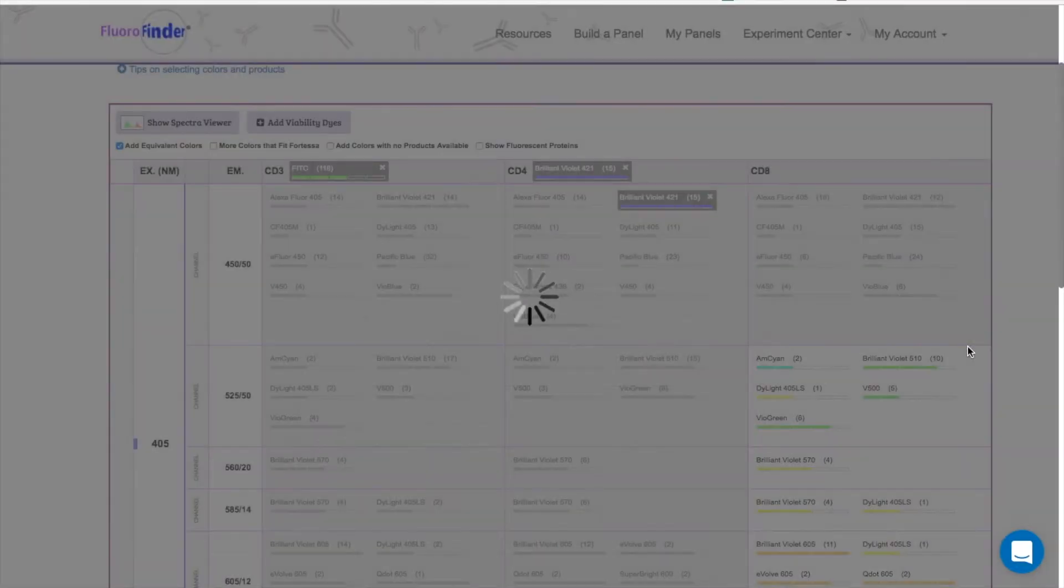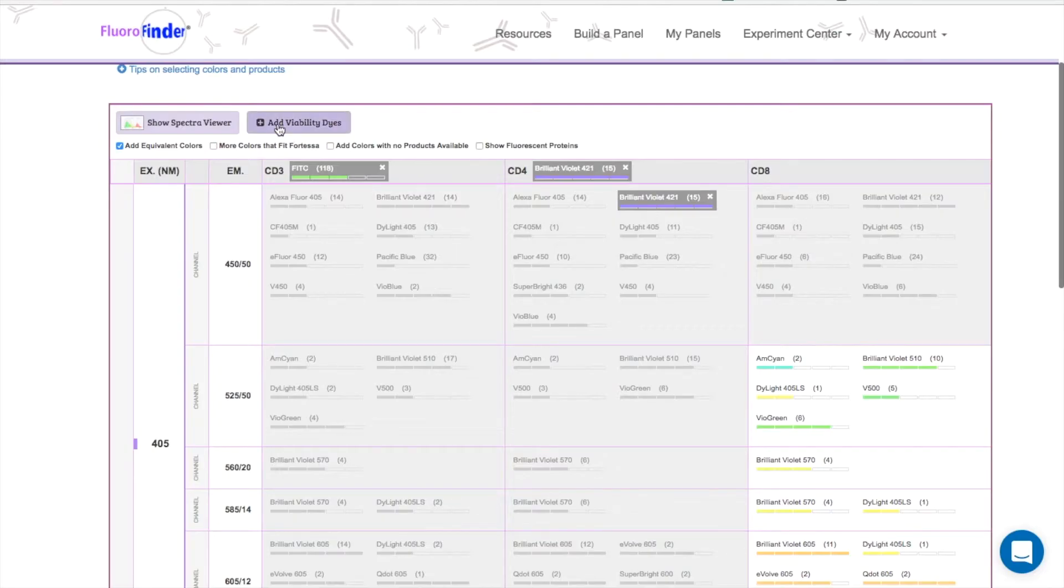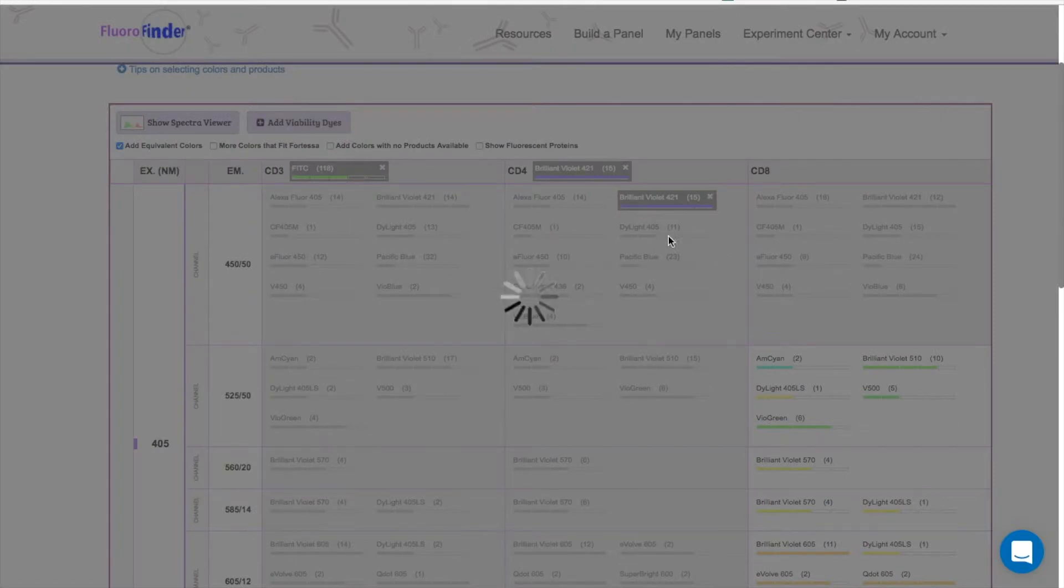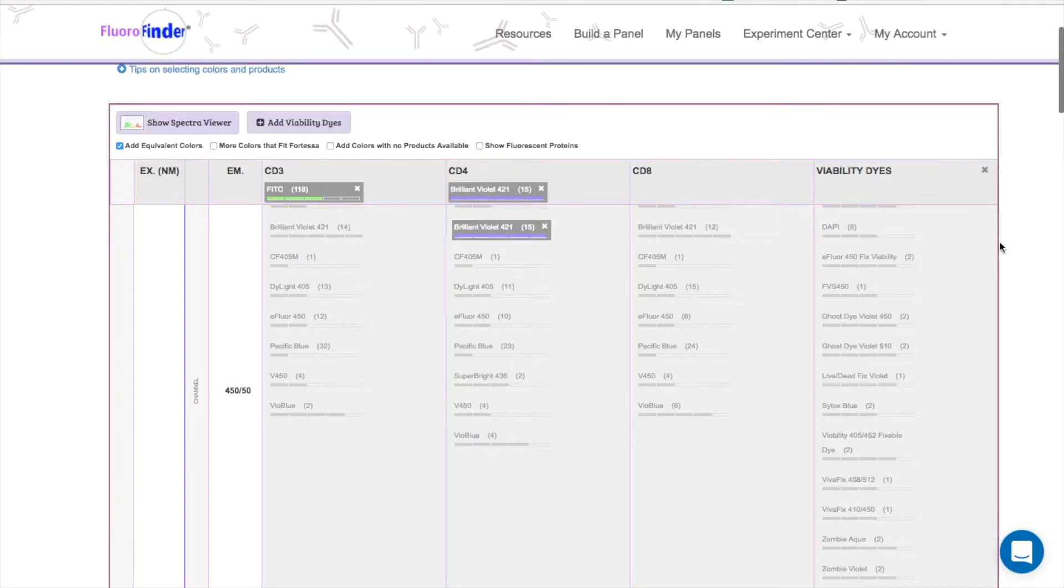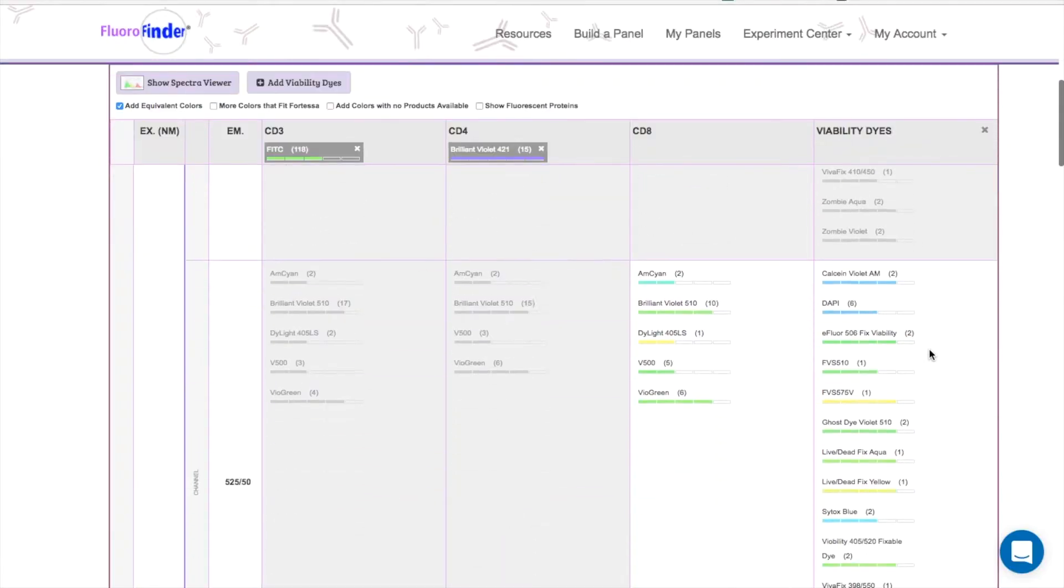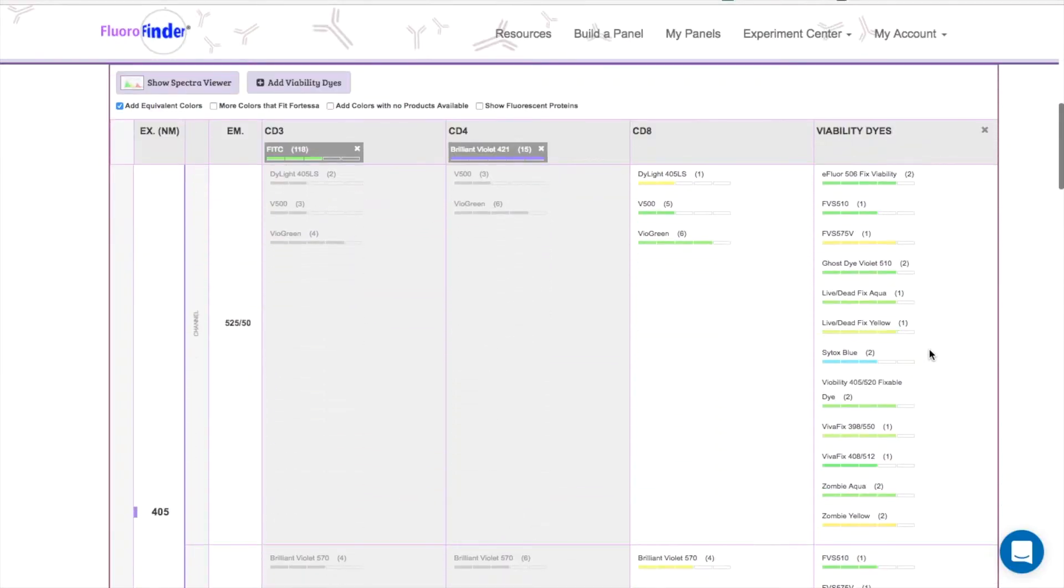Another thing you can do on the products page is add a viability dye. This can be done by clicking this button, and you'll see that Fluorofinder pops in another column with all the available fitting viability dyes. I'll go ahead and pick this Live Dead Yellow.